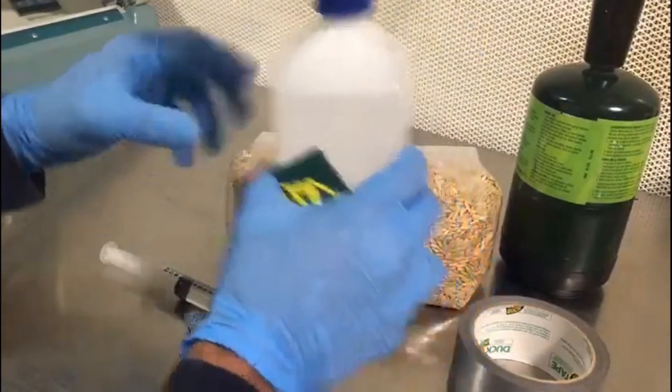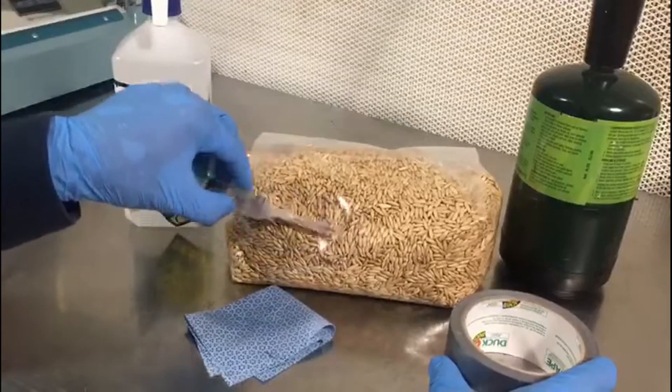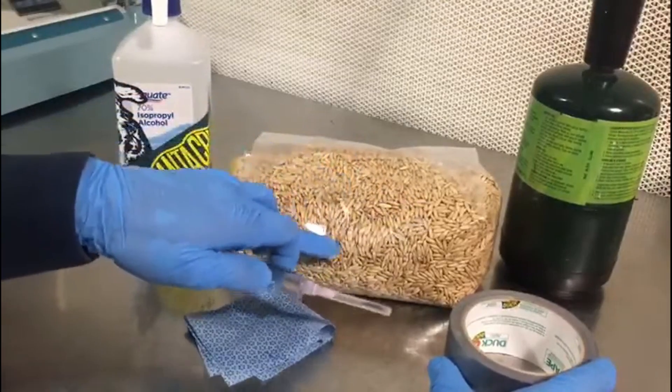Hey guys, so today we are going to be showing you how to effectively create an injection site on a pre-sterilized grain bag that does not have an injection port.